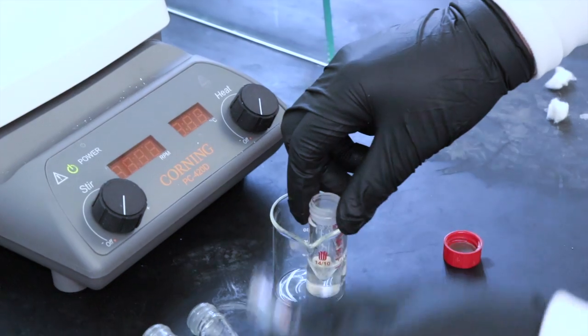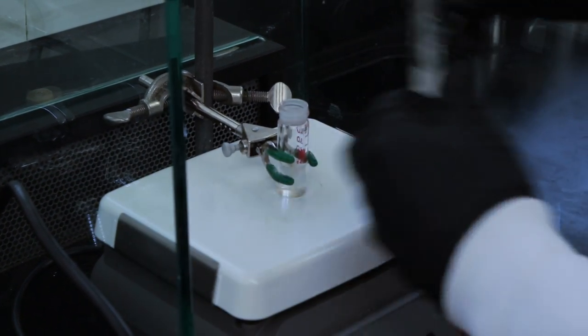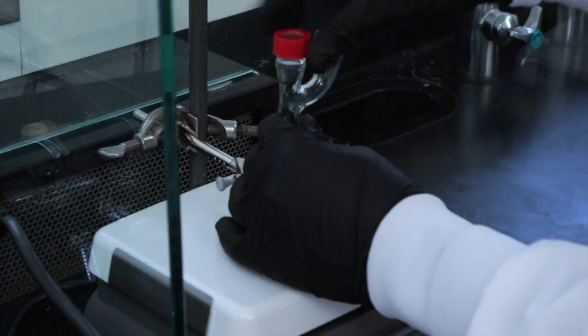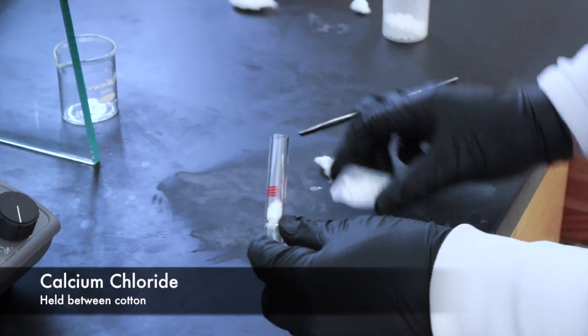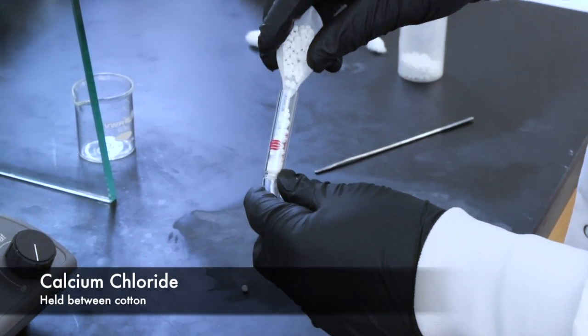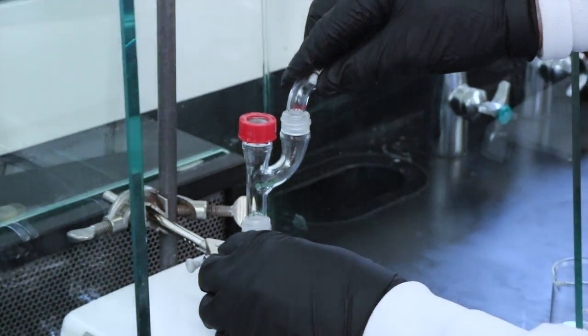Here I'm just going to set up the apparatus real quick, making sure after adding the Claisen adapter to have the cap and septum so I can add the reagents. I'll add calcium chloride to the drying tube to absorb water from the atmosphere, just to make sure that water doesn't react with our boron complex.